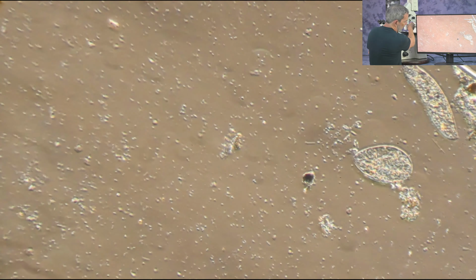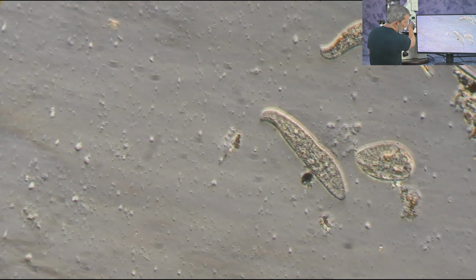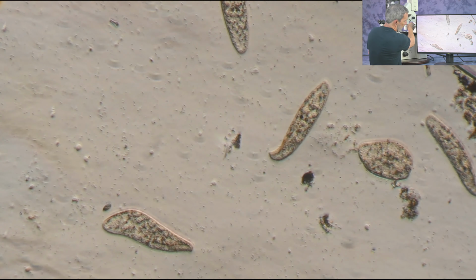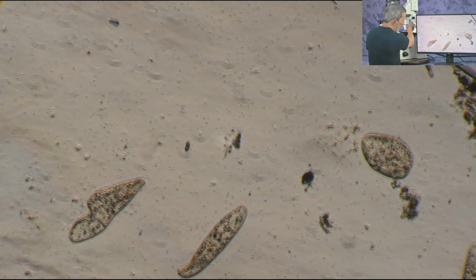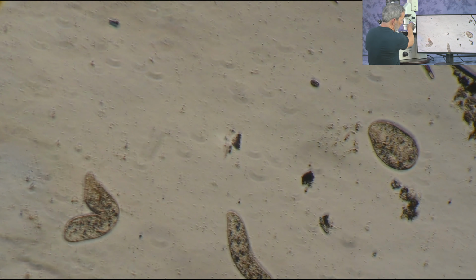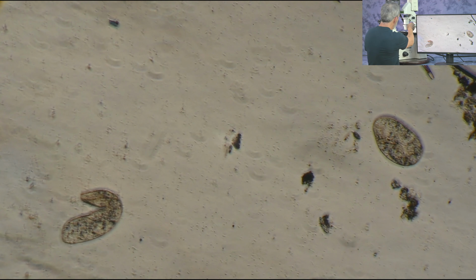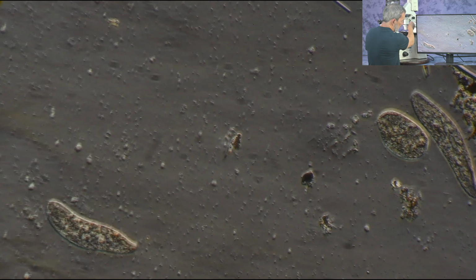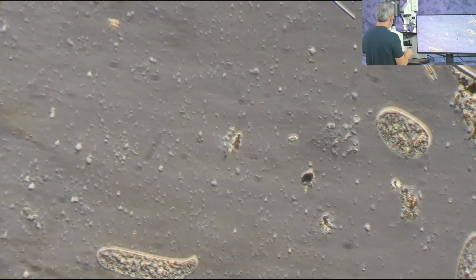Okay, I'm going to take it off of that pseudo dark field, and I'm going to go back into more of a relief type pattern. There again, Varel contrast, LDA plan objective. It's a long distance objective configured for use going through the bottom of a Petri dish. Okay, that is our 20 power.